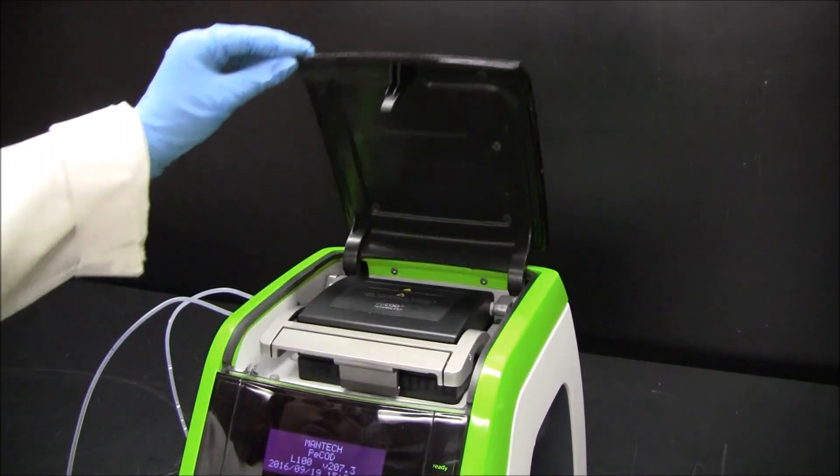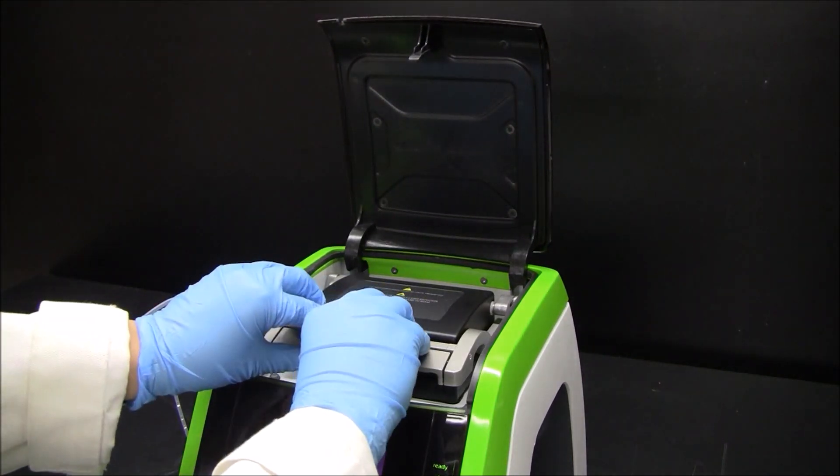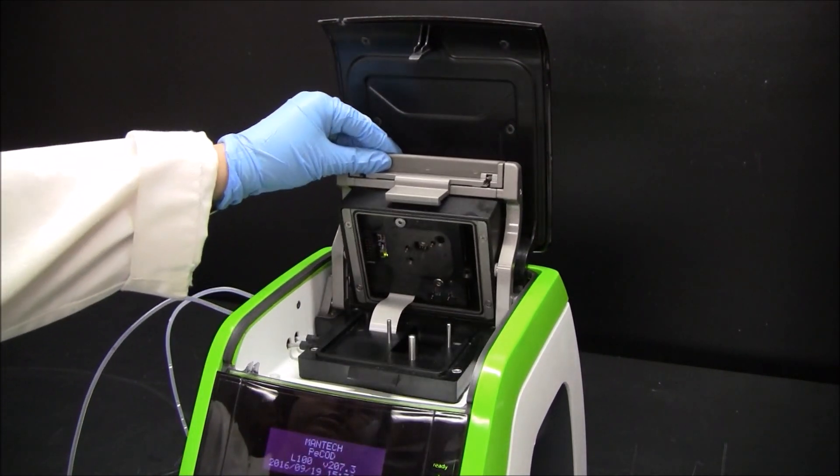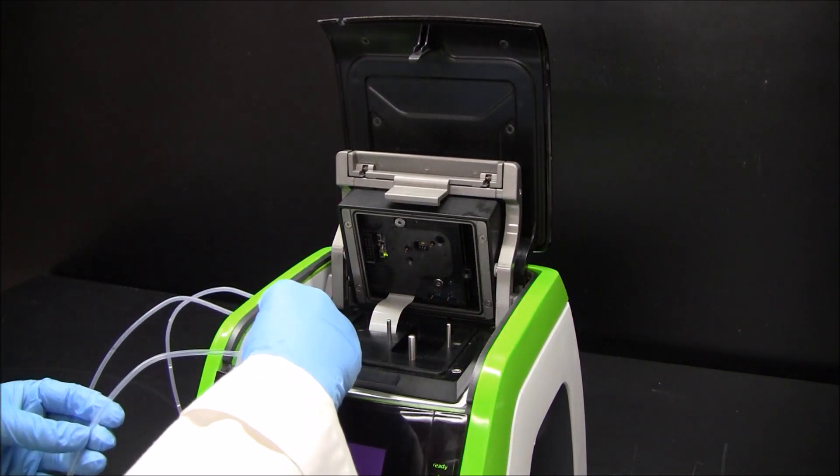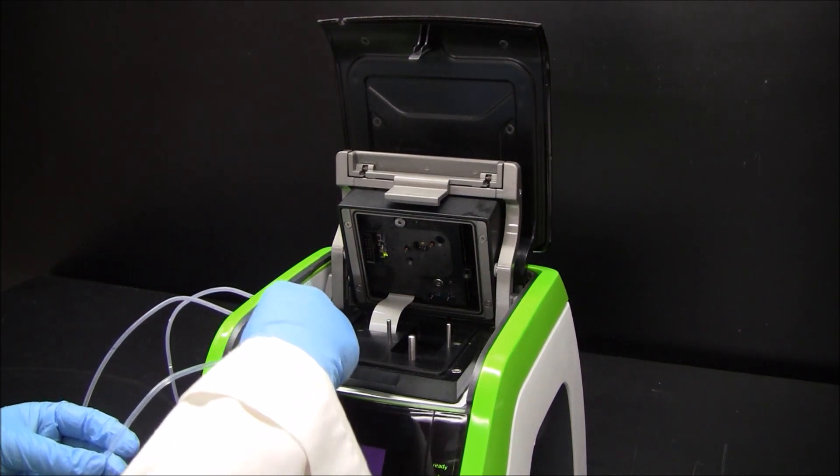Open the L100 lid, then open the analyzer head. Attach the final tube to port A. This will be used for the calibrant and the sample.